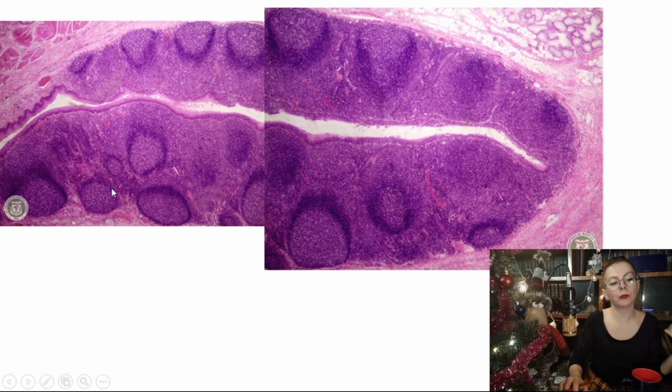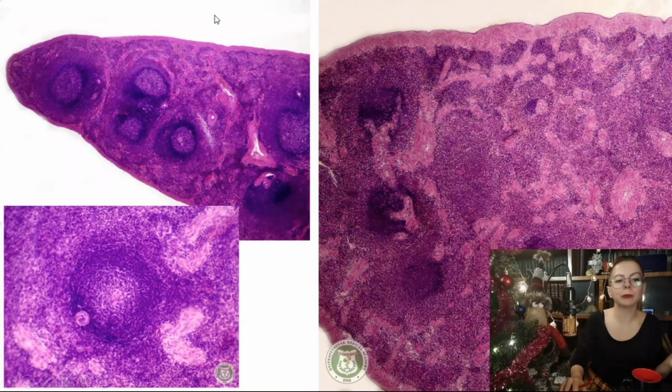So lymphoid follicles here are aggregated along this invagination. If you see this invagination, this is the tonsil, because no empty spaces we can find in spleen, lymph node, or anywhere else. As for the spleen, as I told you, lymphoid follicles here are distributed uniformly, randomly, and it could be differentiated by the capsule.